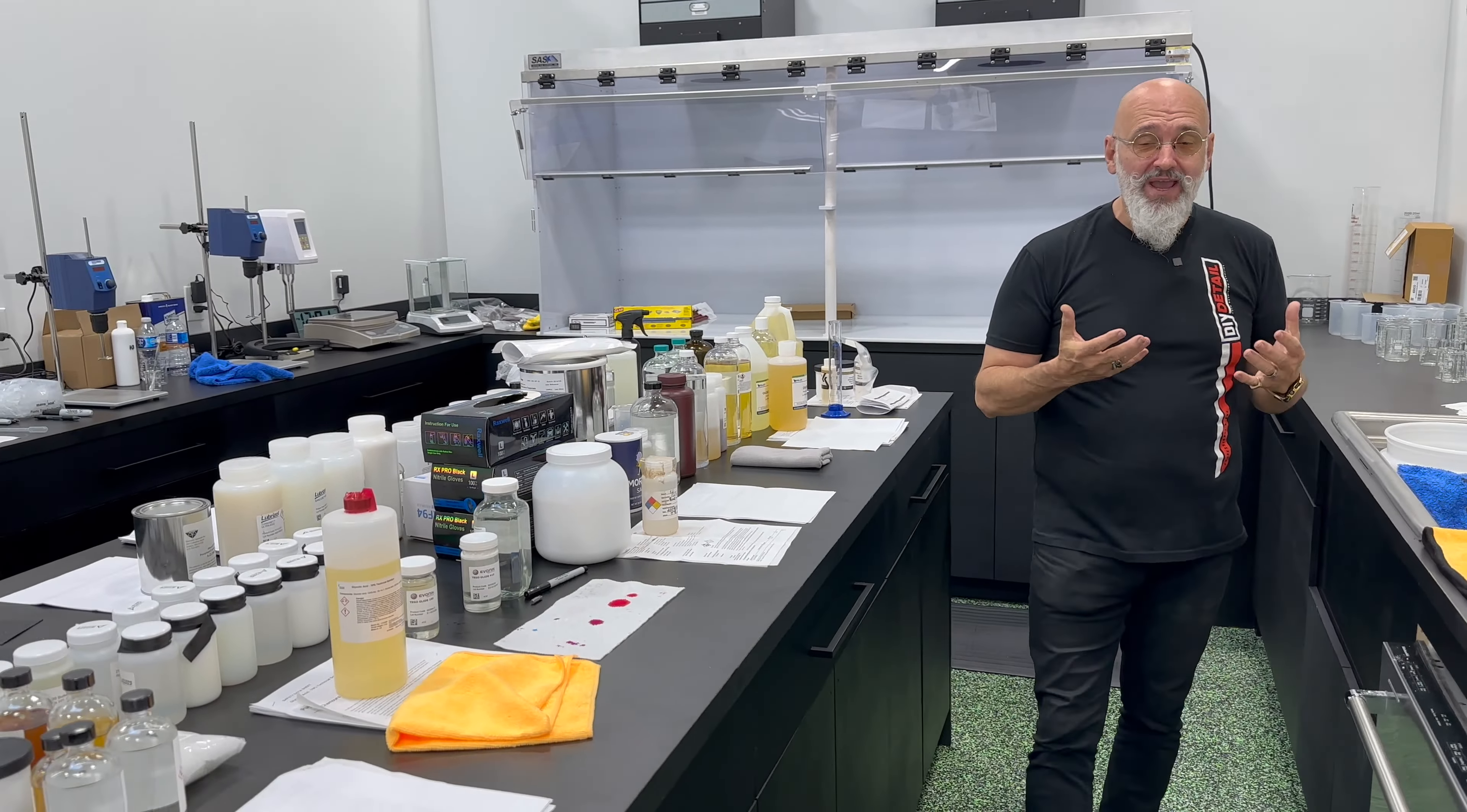One thing that's important is how does the product perform in the bottle. And in this chamber, we can actually create a vacuum and a pressure to see how the bottle reacts, how the bottle works. Because when we're shipping stuff overseas by plane, we want it to get to the other side without exploding or imploding in the plane.